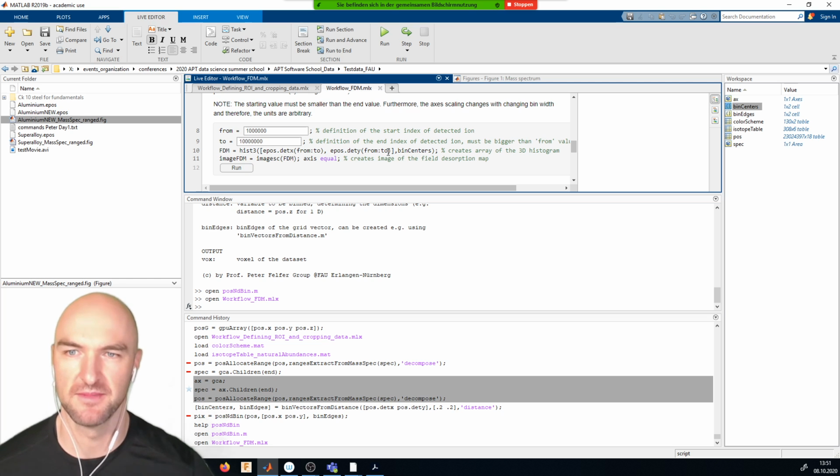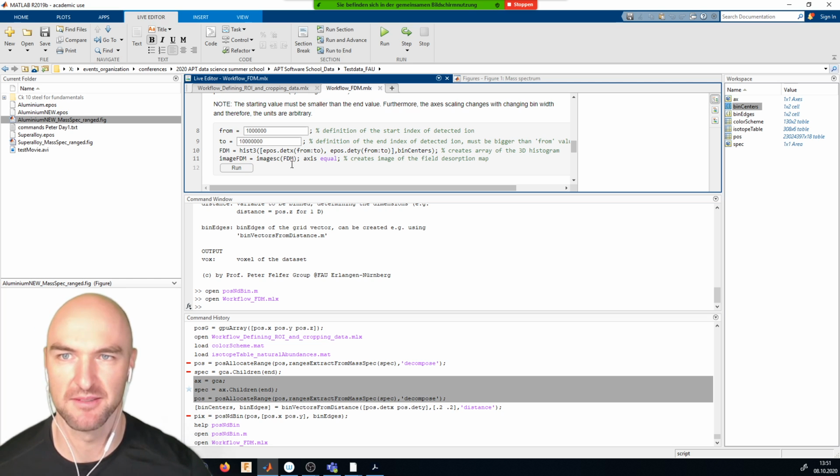Oh yeah, sorry, I was getting ahead of myself. In this case, it's just a histogram.